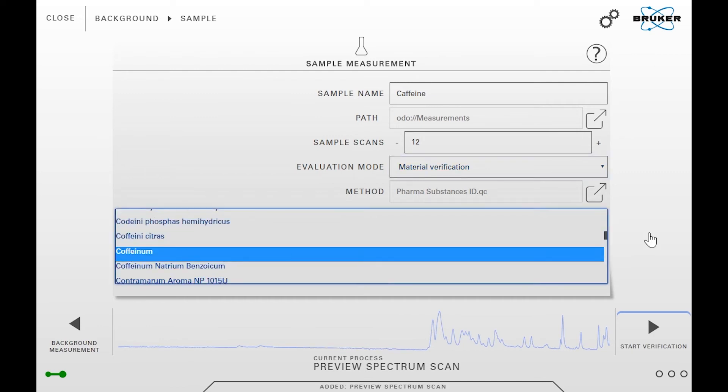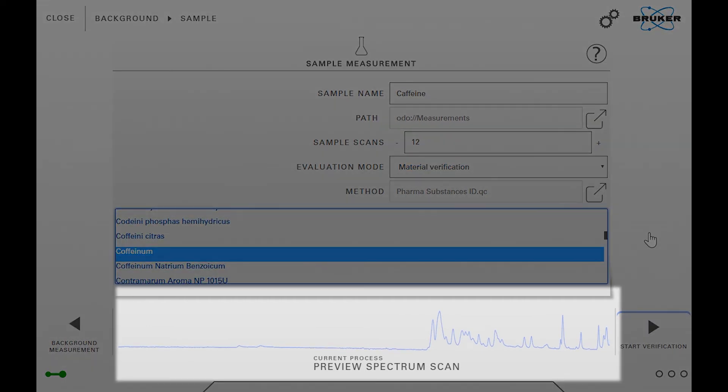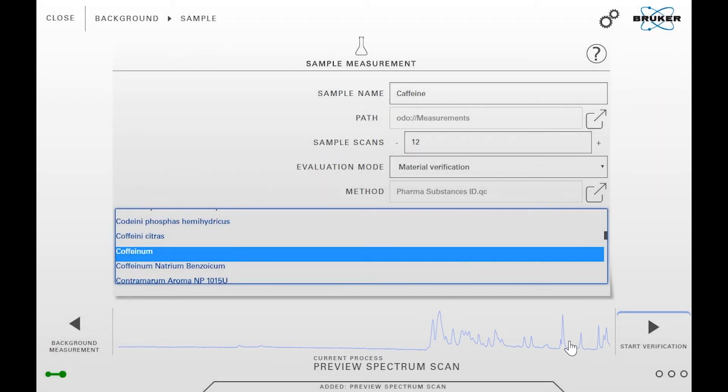Back to the measurement dialog. At the bottom you can see a preview spectrum of the sample. You can tap on that field in order to enlarge the preview spectrum. Use the gear wheel icon on top in order to configure your input fields.